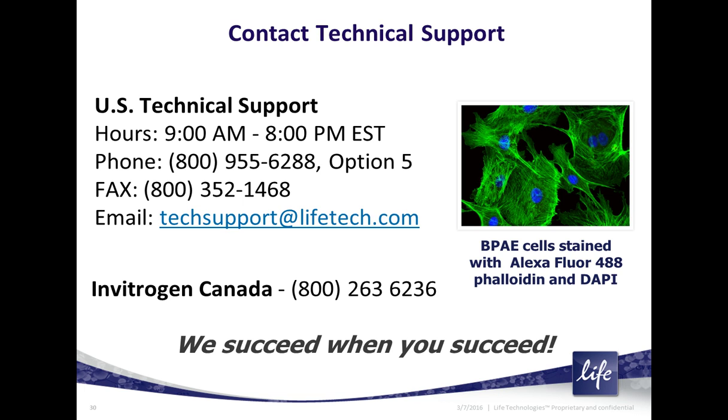Like I said, VectaShield, for instance, in the far red won't work so well. Be careful, some antifade mountants that are advertised as antifades actually don't have components that are antioxidants that would stop the photobleaching. Instead, they just cure hard, which can slow photobleaching, but that's not always sufficient. So you need to check that with the company that sells it.